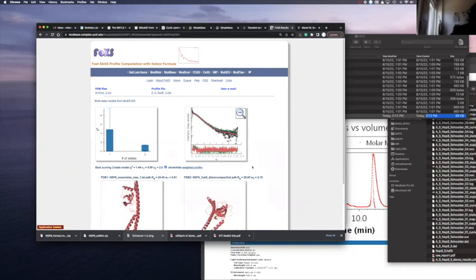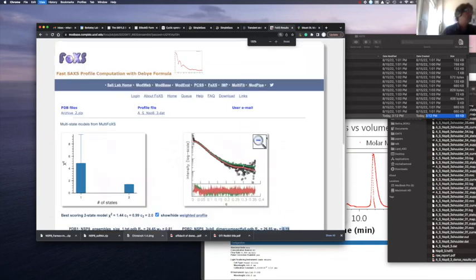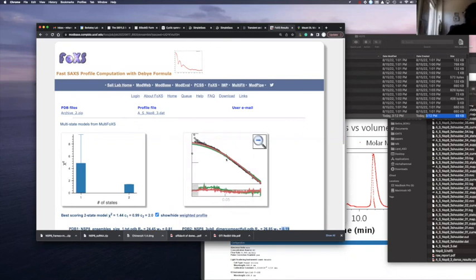Yes, in both cases, we improve the chi-square by adding a mixture of, in this case, about 81% and 19% of monomer and dimer. And most important, it really improved the small Q region. So you can see here a significant improvement by using a few percent of the dimer.